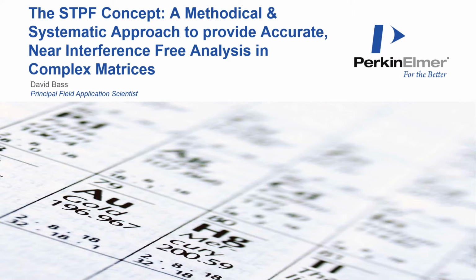In today's talk, I will discuss the Stabilized Temperature Platform Furnace concept, also known as STPF, and the various components that comprise this technique in detail to provide a more complete, rugged, and systematic approach for graphite furnace analysis.